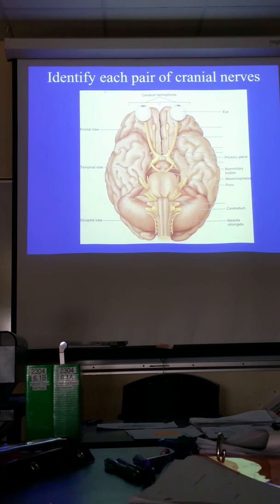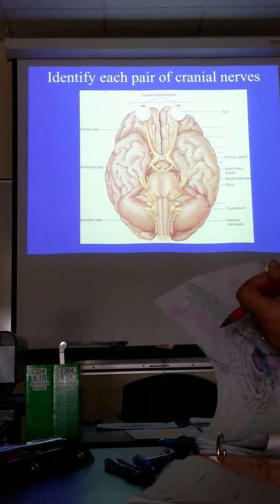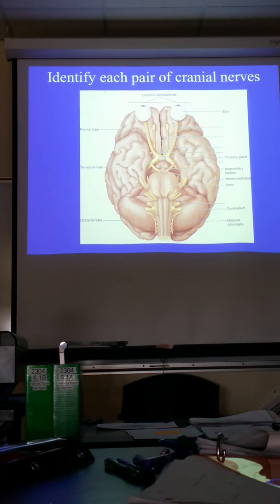We know now each of these parts. So do you guys want to give it a shot, or do you want to practice? We have a good 20 minutes, we have 30 minutes. You want to give it a shot, dissecting those brains?